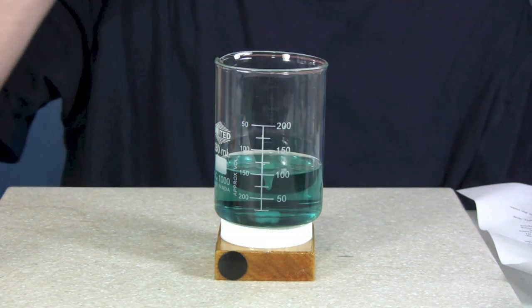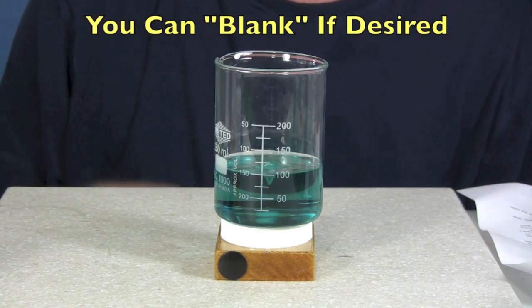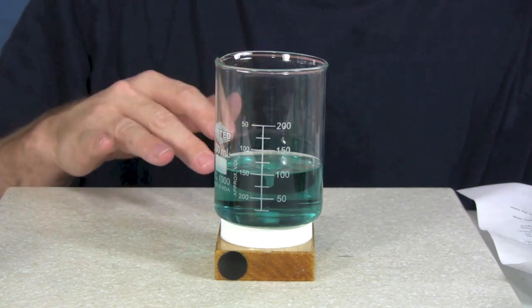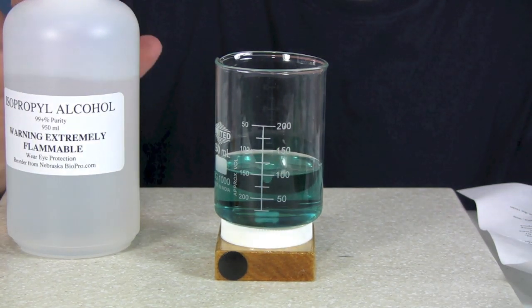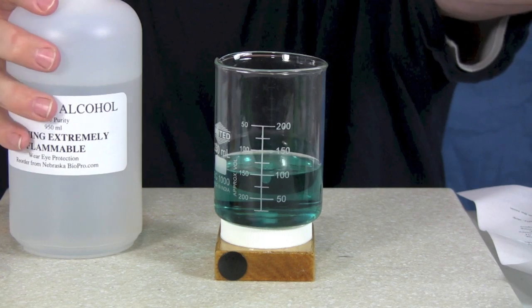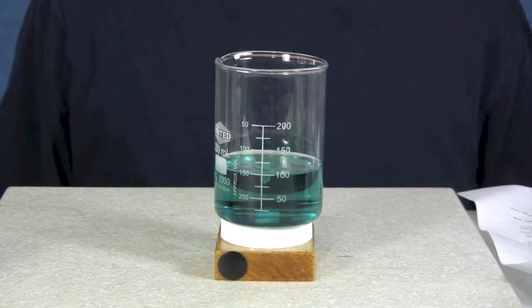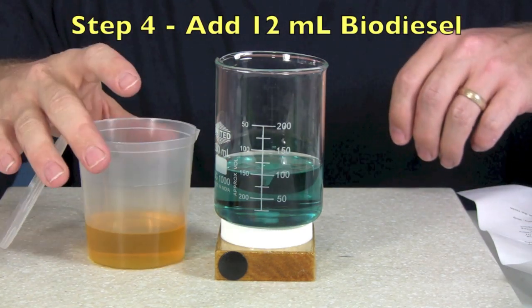At this point, the instructions say you can blank the sample — in other words, add a little bit of your titration solution to turn it to yellow and then turn it back to blue. If your isopropyl alcohol is old and you're worried about that, you can do this. Mine's brand new so I don't need to blank this sample. So at this point I'm going to measure in 12 milliliters of my biodiesel.